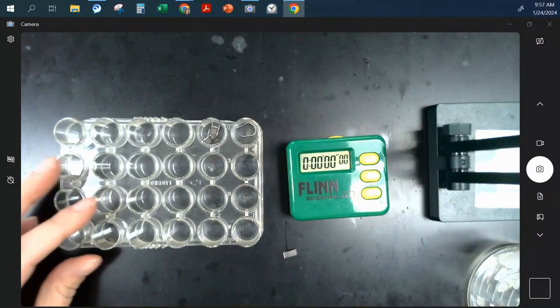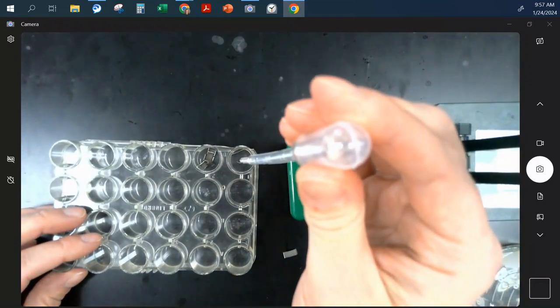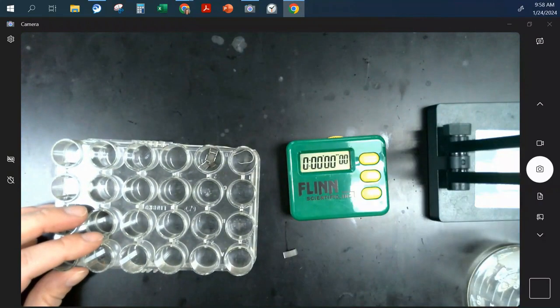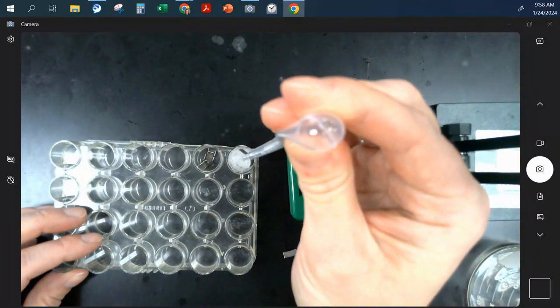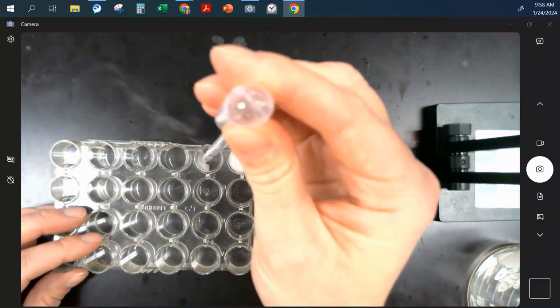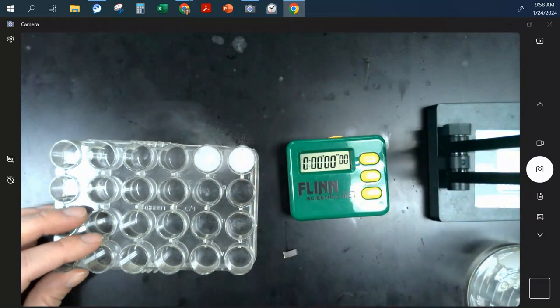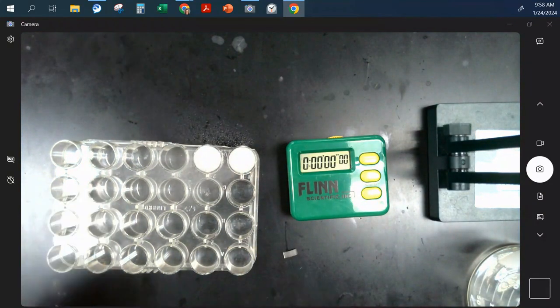Okay, so we could take some hydrochloric acid and put it in here. Maybe I should measure the same amount. I don't know if I'm doing that. Okay. So I just put 1 milliliter in there. Okay, this is not very good because I didn't measure the time. I also added different amounts, so that's great. You're going to do this much more carefully, I'm sure.